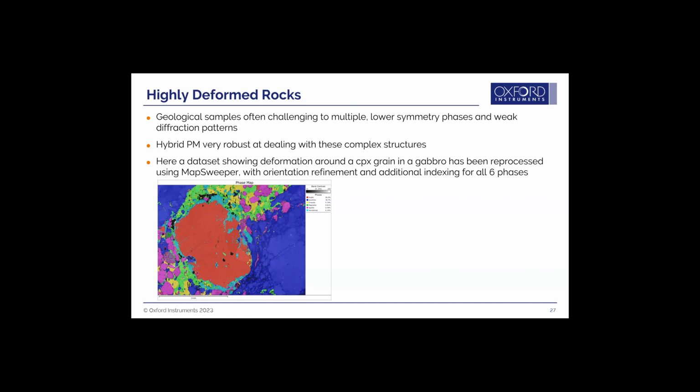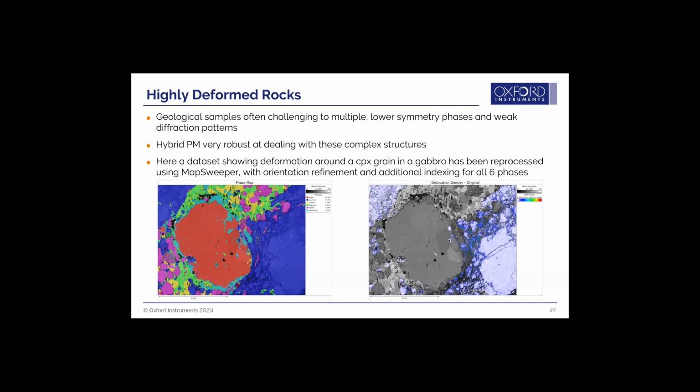And this is a gabbro sample. There are multiple phases in here, and we've used the refine sweep to make sure that we got all the phases accurate. But what people really wanted to study in this was the anorthite grains, the grains in blue there, looking at deformation in the anorthite grains. And this is actually the weighted Burgers vector map. So this is a dislocation analysis. There are similarities to kernel average misorientation, without diving way into this.